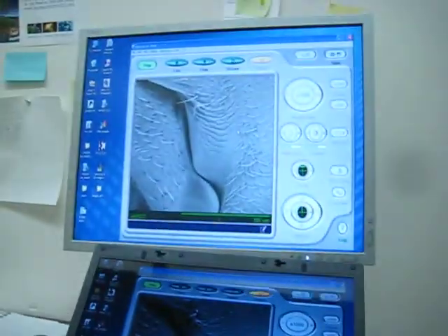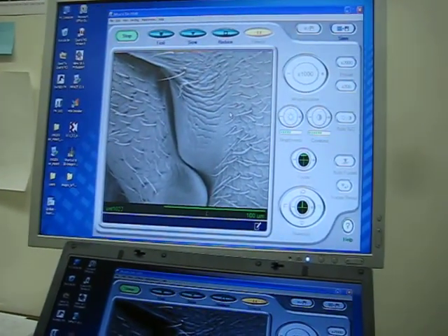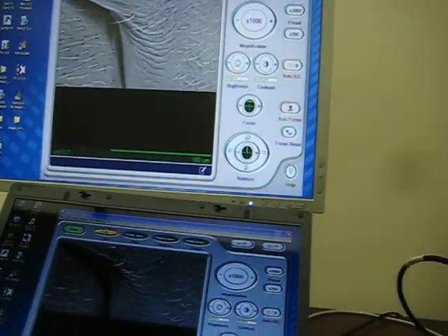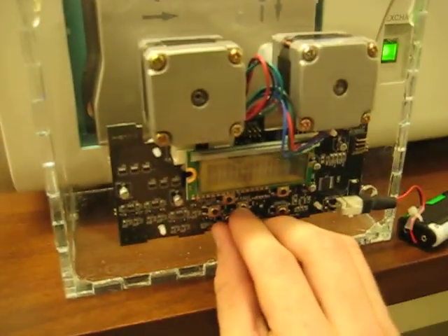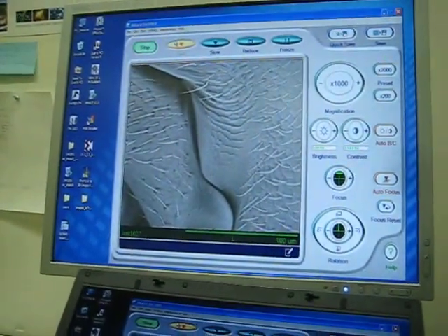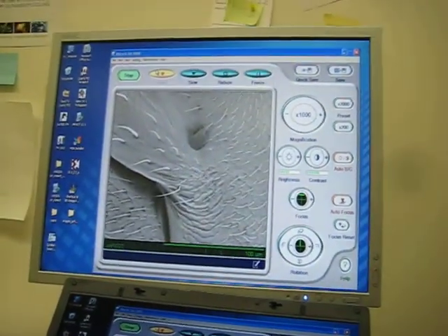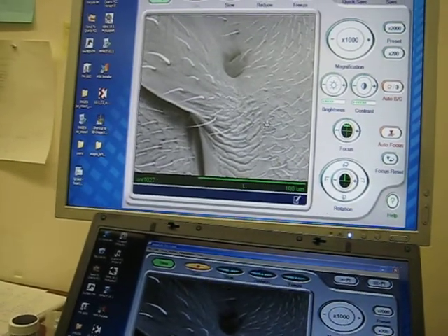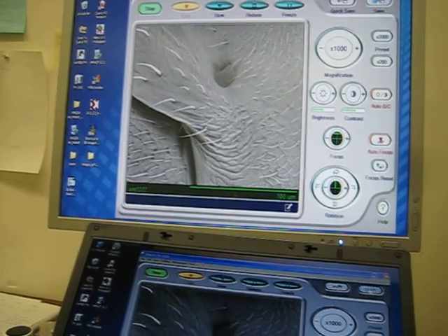Right now we're looking at the head of an ant. This is a zoomed-in view, 1000x. We'll manually progress to the next image by pressing this button, and you should see the image progress. Then go through a little bit of focusing, and then save the image.